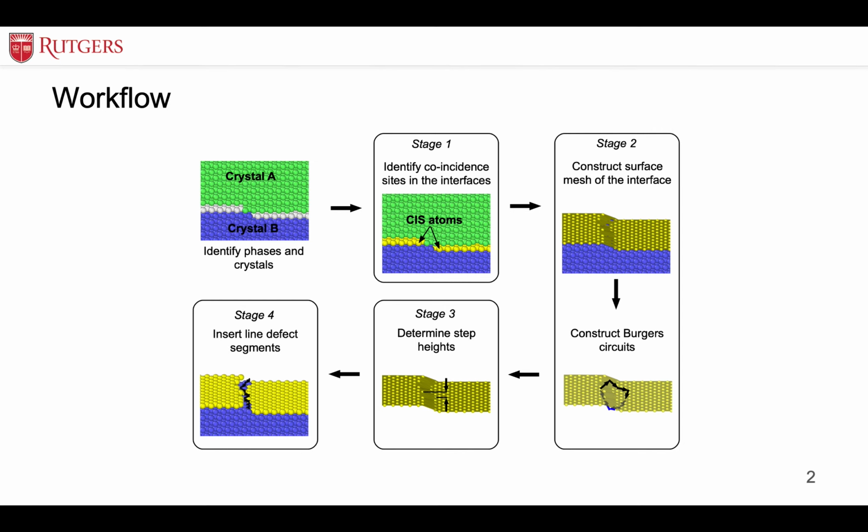Okay, so before we jump into how to use it, I want to just quickly run through what is going on under the hood with ILDA. We just had our paper on the ILDA method accepted for publication by Acta Materialia, so that should come out probably in the next week or two. This is the middle of June when I'm recording this, and this figure is from that paper. So you can get more details soon as that comes out for publication.